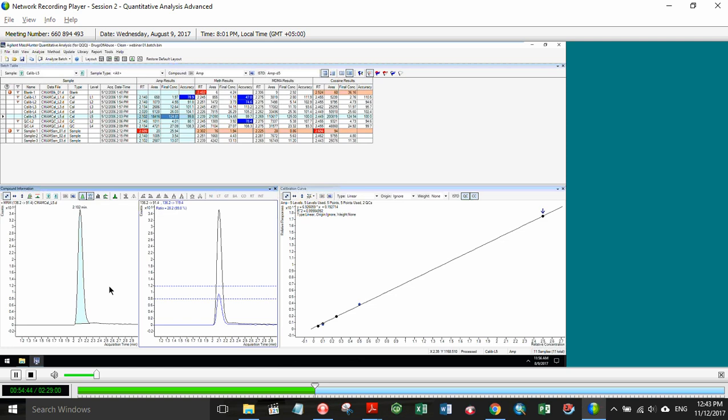We also talked a little about manual integration. That's really straightforward, just like in most programs: click, drag, you can move things around. Notice once I start to do manual integration, I have the option of selecting the little canned comments we have here.